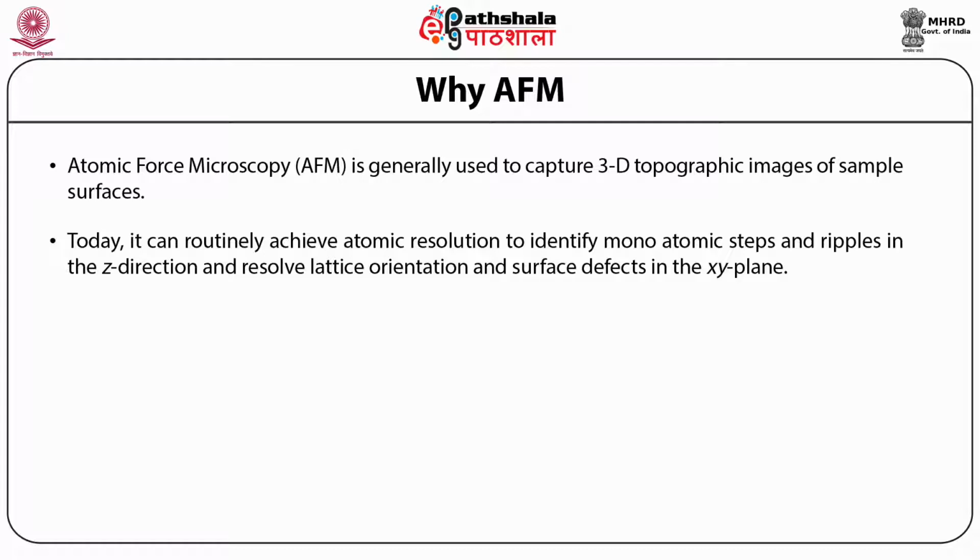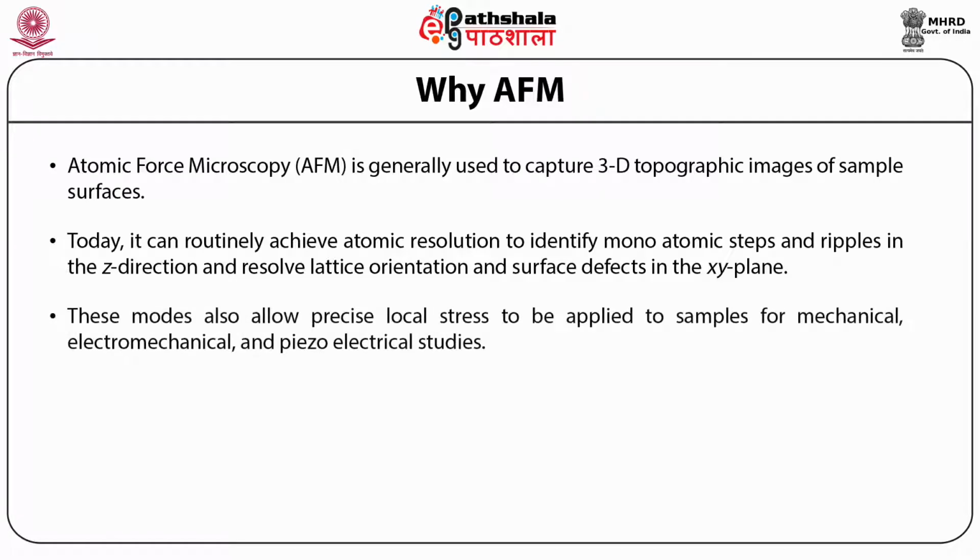In addition to traditional constant and tapping mode, novel modes have been developed to stably control ultra-low imaging force, thus preserving both the AFM tip and fragile sample. These modes also allow precise local stress to be applied to the sample for mechanical, electromechanical, and piezoelectrical studies beyond topography and local force control.